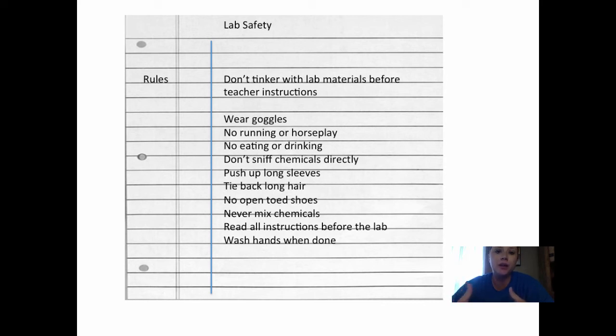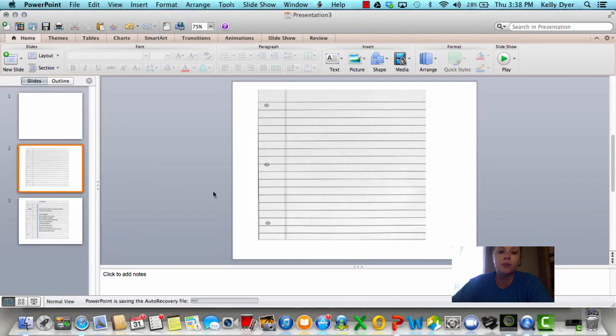I realized during the video that I forgot one on here, so I wonder if anybody could catch me and tell me what it is. I'll give you a minute to think. The one I actually forgot was to notify the teacher if there's a spill.